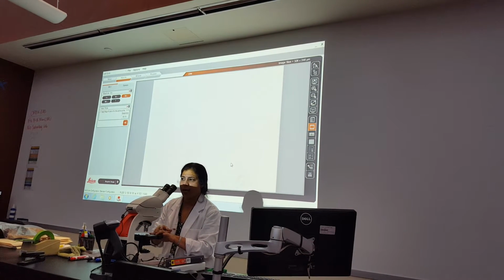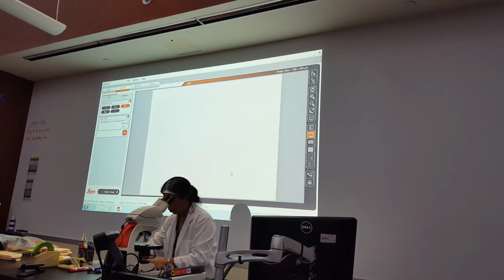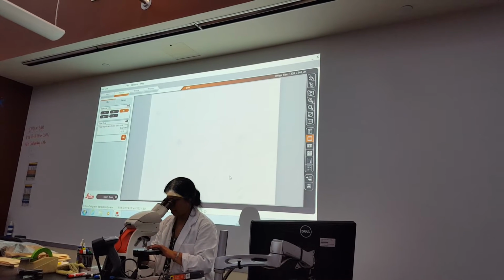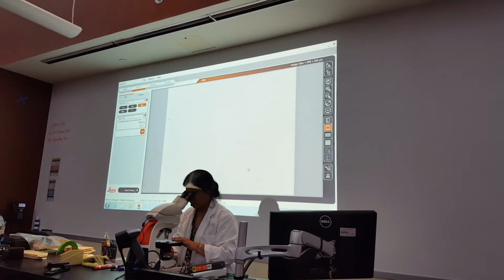Will the capsule be here still? Not here. Okay, now let's see what's coming up. What do you think will come up next? Just guess. We did Archegonia. What should you see next? Antheridia.